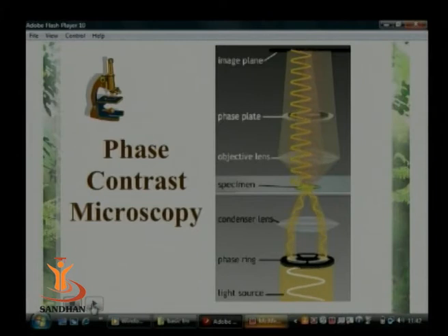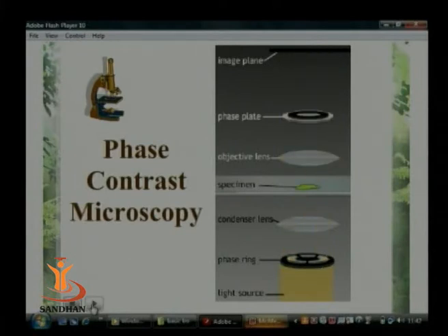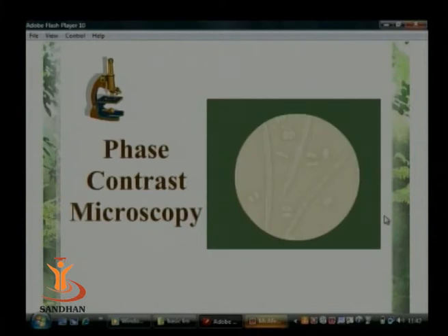now because they are transmitting in different phases, the phenomenon known as interference will take place, where the rays will cancel each other as their troughs meet each other. Because of this, the areas of continuous brightness and darkness will develop, and the next slide will show us exactly how an image develops.